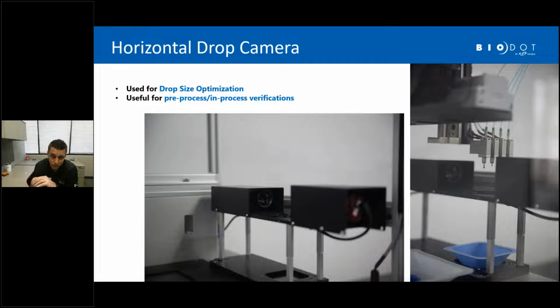So this is the image. This is the image of a drop. As you see here, a 10 microliter drop in our software. These are live images that can be recorded. It's hard to see in this view, but we also capture statistics. We can actually calculate the volume of that drop. We assume symmetry around the z-axis, and so we integrate that volume or the size of the drop to calculate a volume. And then ultimately we can look at CV, so precision of drop to drop.